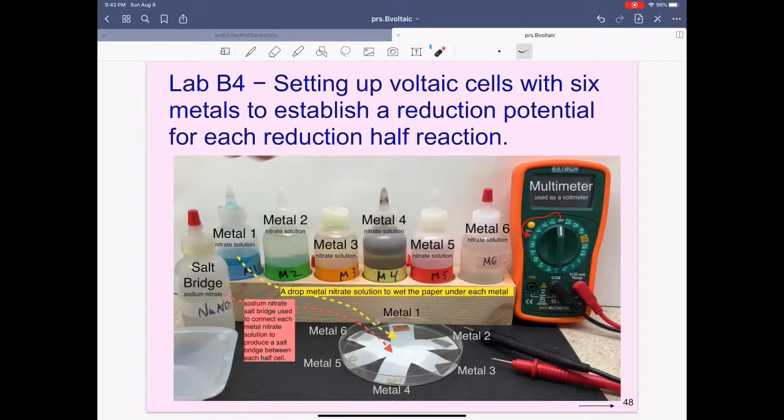In this Lab B4, we'll set up voltaic cells with six different metals to establish a reduction potential for each of the reduction half-reactions. We'll use the six metals with each of their corresponding nitrate solutions.